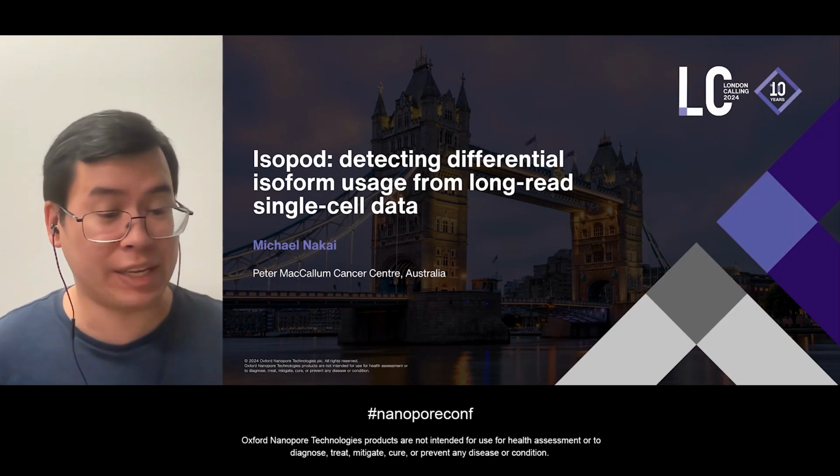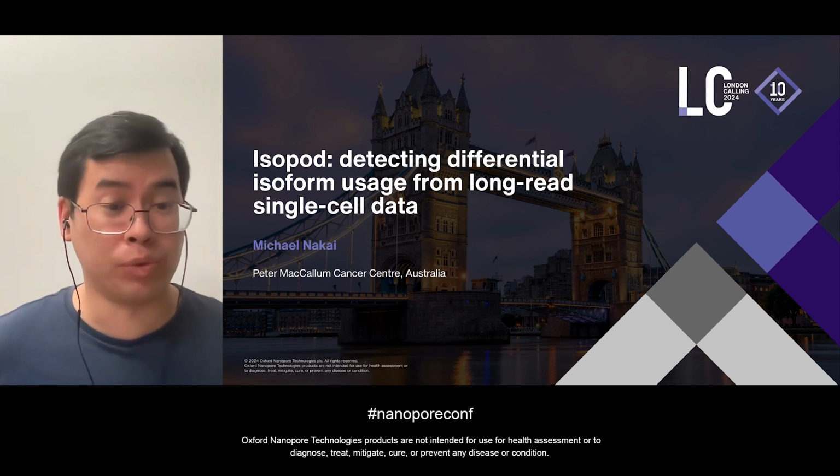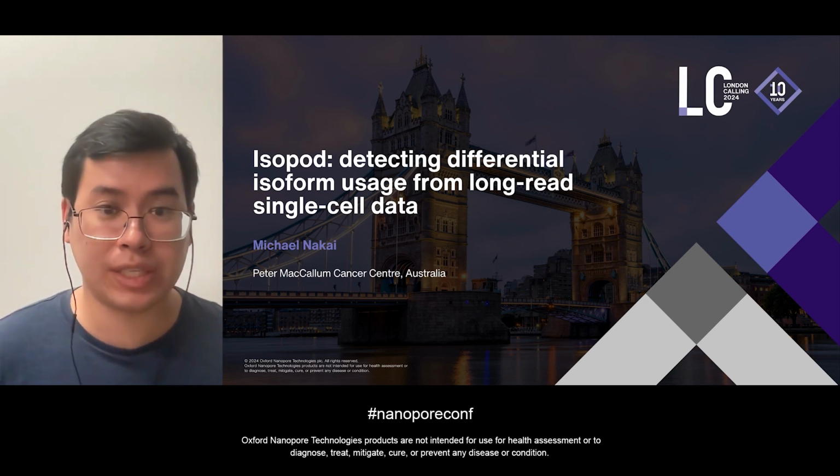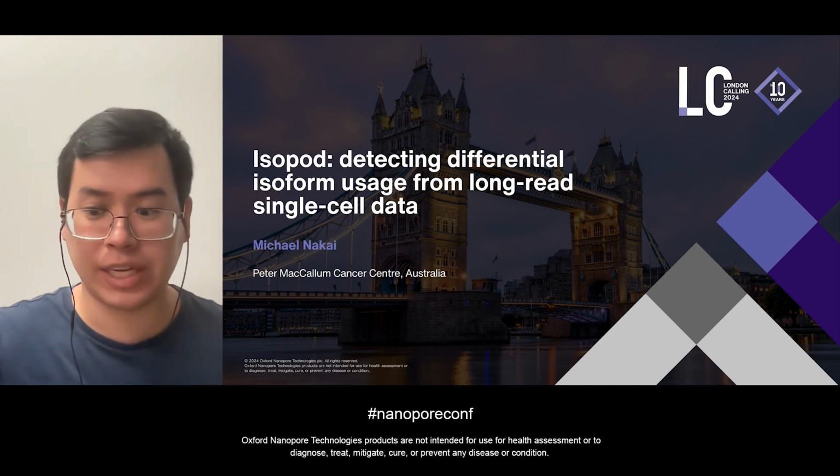I'm a PhD candidate at the Peter MacCallum Cancer Centre in Australia. And today I'd like to talk to you about the tool we're developing called Isopod, which is a tool that detects differential transcript usage from long-read single-cell data.